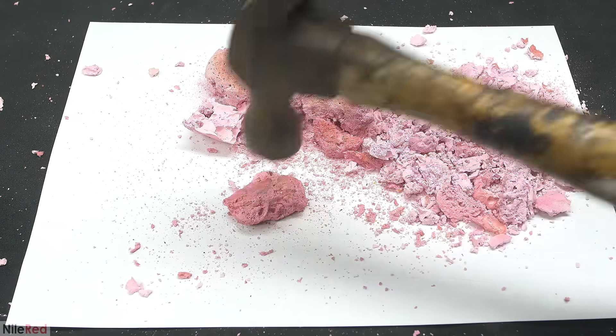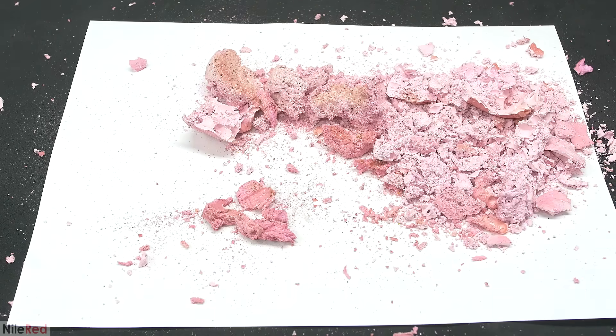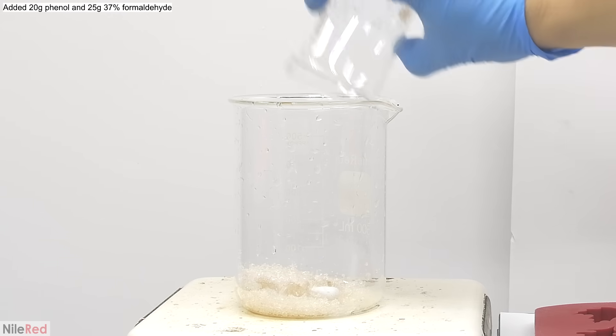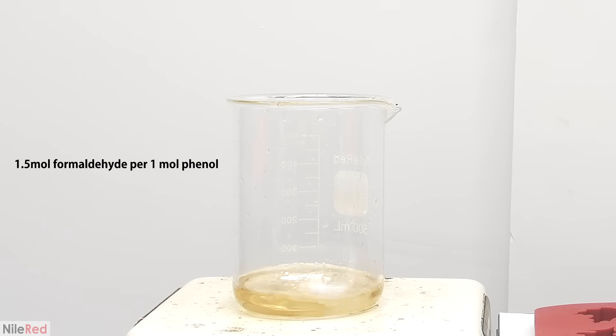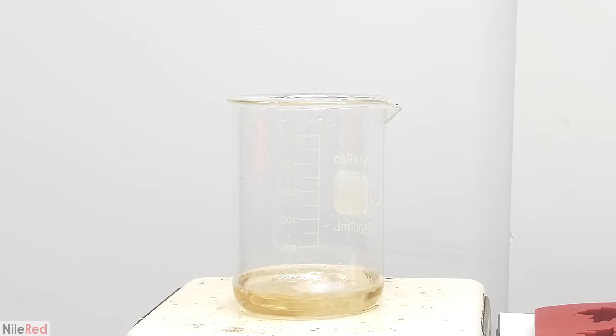After smashing it, I moved on to making Bakelite the proper way, starting with Resol. To make the Resol, I'll be using phenol, formaldehyde, and a little bit of sodium hydroxide. I mixed 20 grams of phenol with 25 grams of formaldehyde solution. If you recall from the introduction, Resol is made with an excess of formaldehyde. The ratio that I'm using here is about 1.5 moles of formaldehyde for every mole of phenol. Once all of the phenol had dissolved, I add several drops of 10% sodium hydroxide, which will act as a base catalyst. I turned on the heating, and I tried to heat it to between 70 and 100°C.